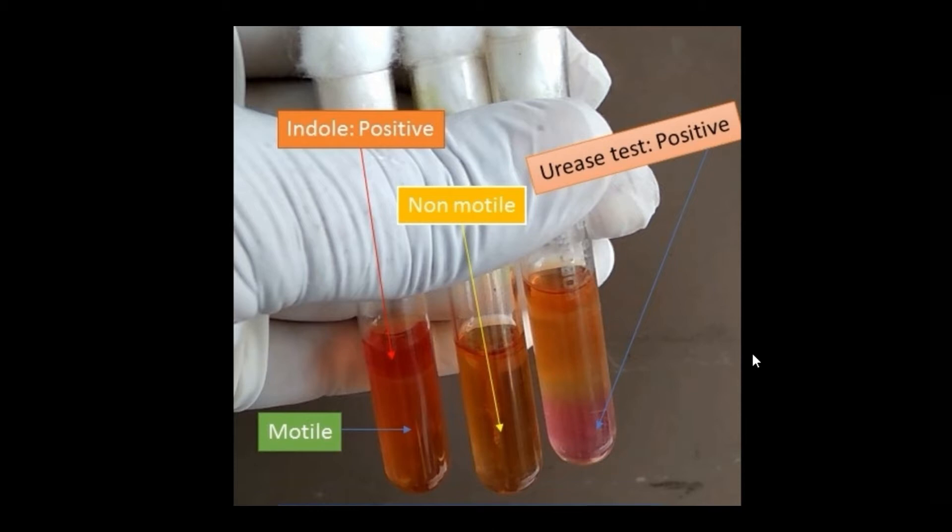These tests are useful to identify gram-negative bacteria on the basis of these three parameters: motility, indole, and urease. These three tests are performed in a single test tube.